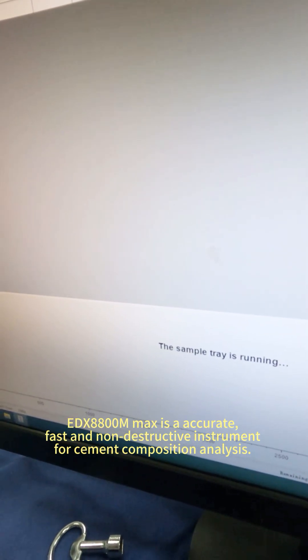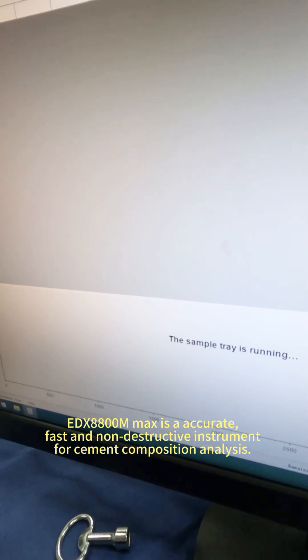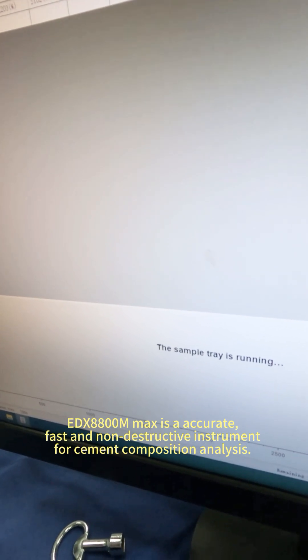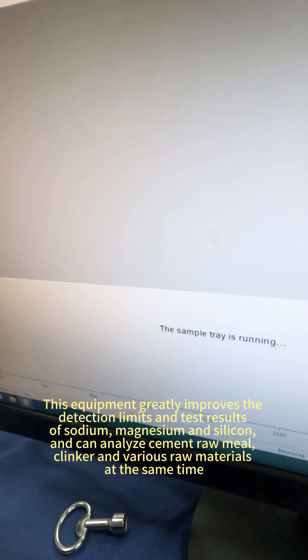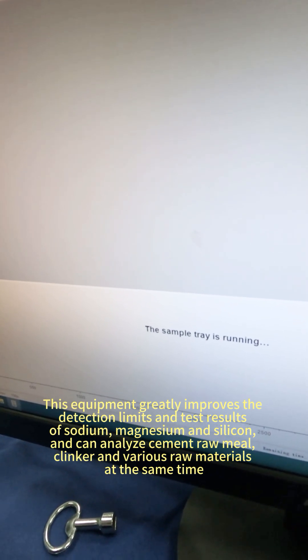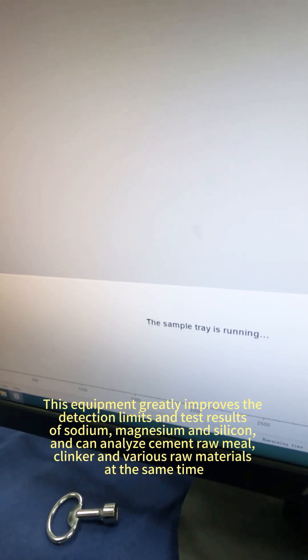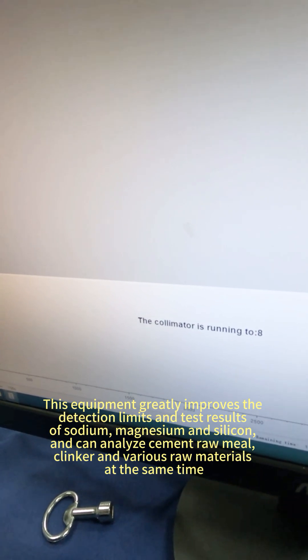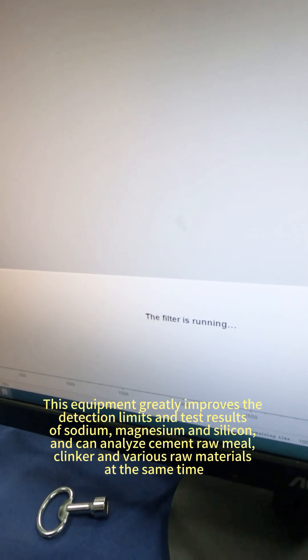EDX8800M Max is an accurate, fast, and non-destructive instrument for cement composition analysis. This instrument greatly improves the detection limits and test results of sodium, magnesium, and silicon, and can analyze cement raw meal, clinker, and various raw materials at the same time.